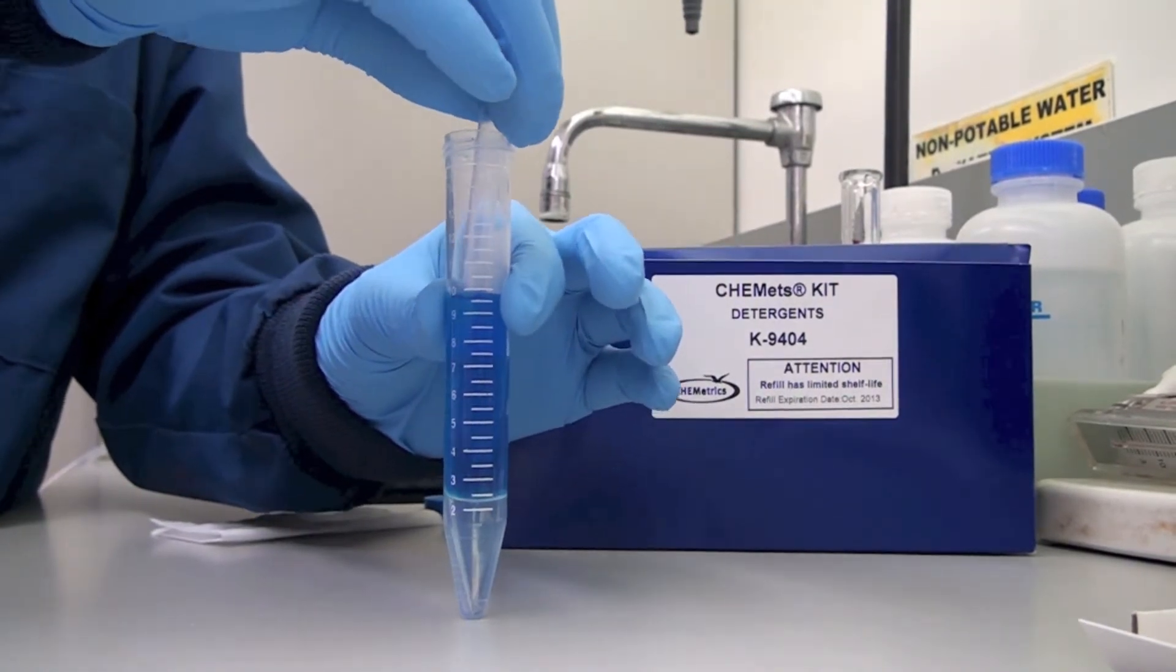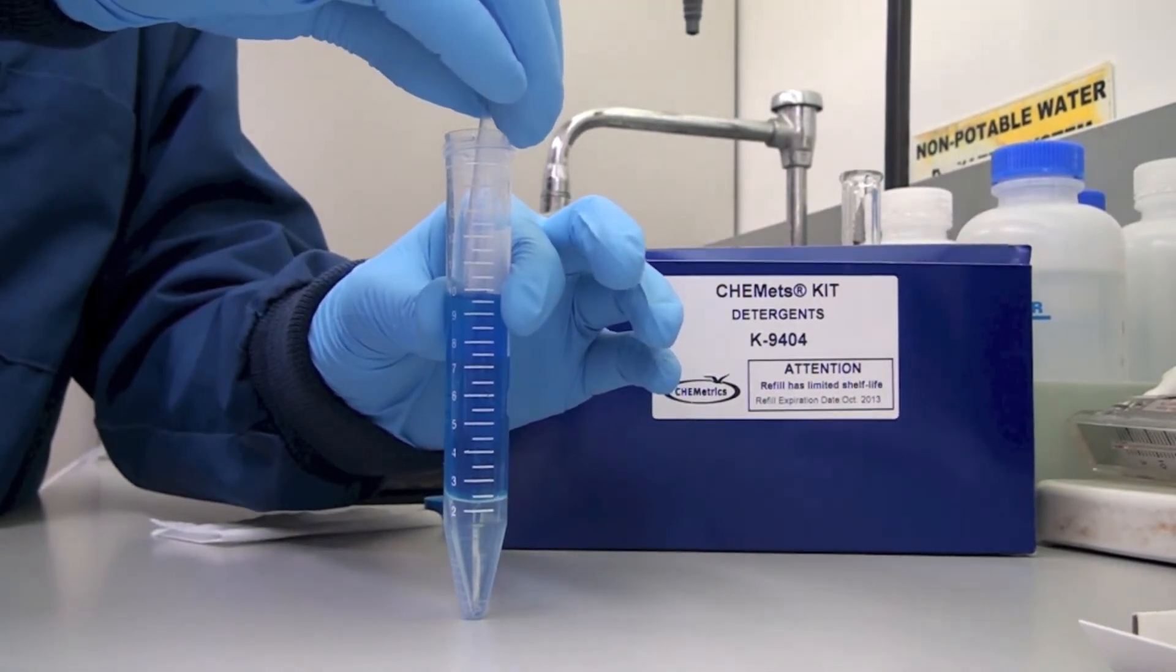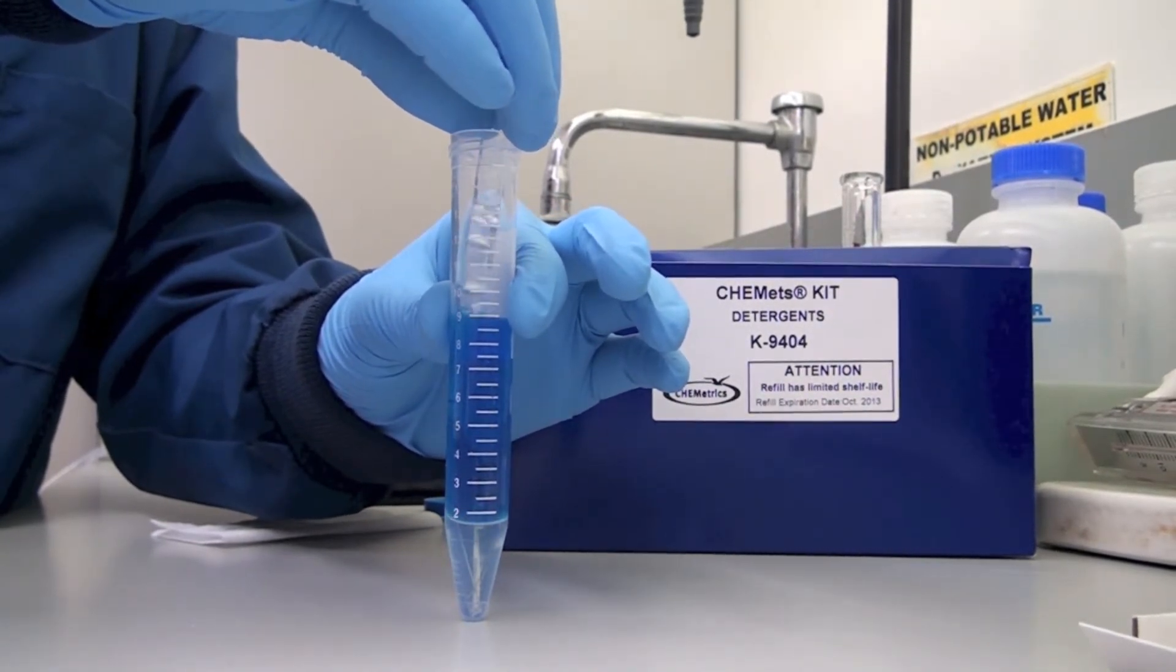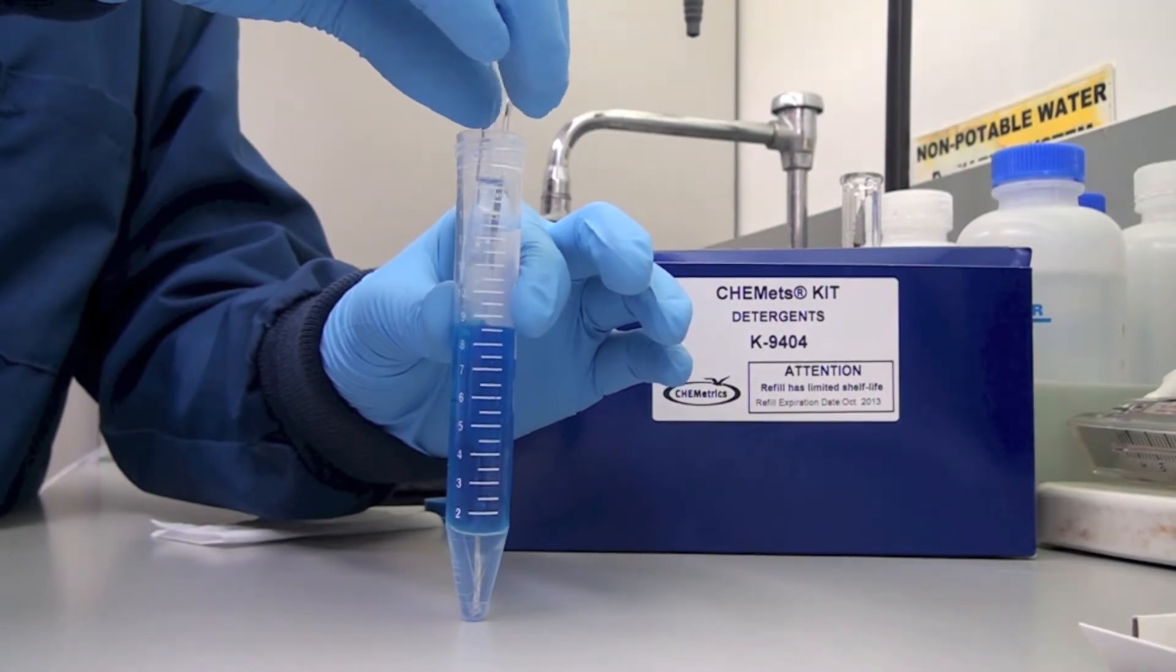Break the tip of the Chemet ampule by gently pressing it against the side of the reaction tube. The ampule should draw in fluid only from the organic phase or bottom layer.